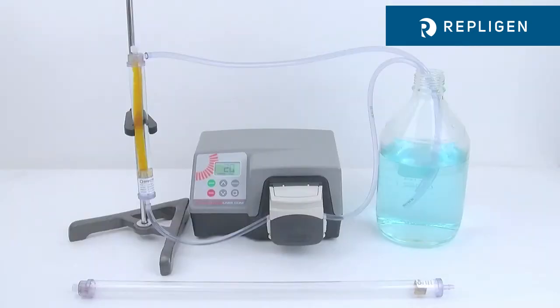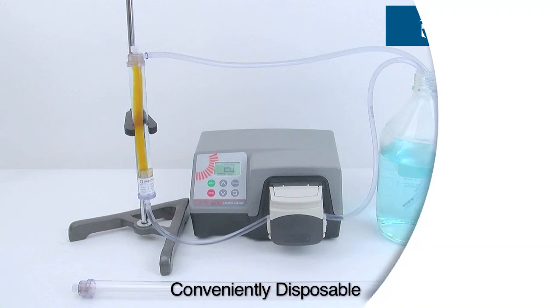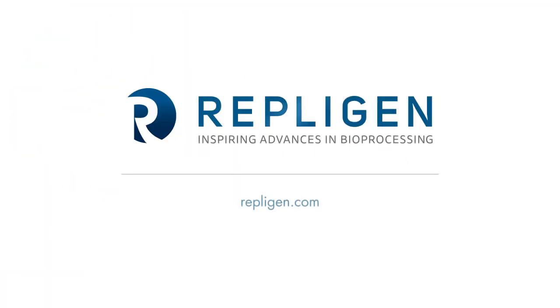The Tubalizer Dynamic Dialysis Device achieves 98% recovery and sample purity, is easy and ready to use, provides the convenience of disposability, and reduces dialysis from days to hours.